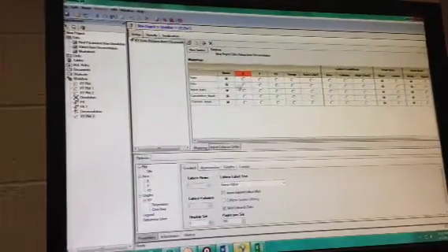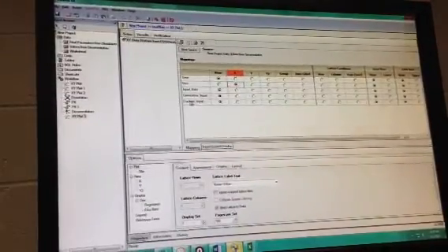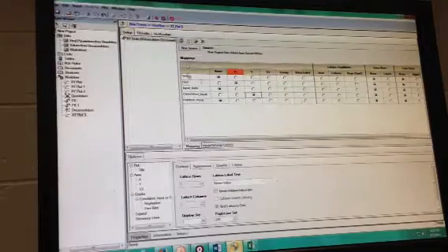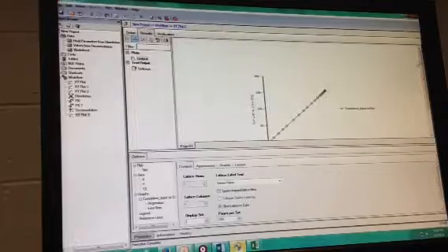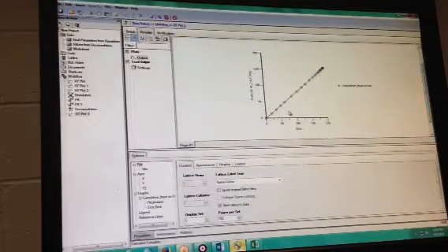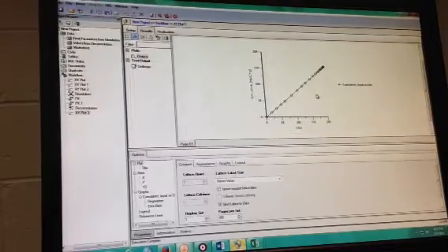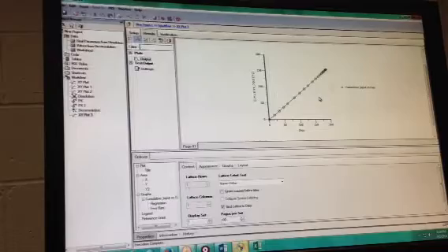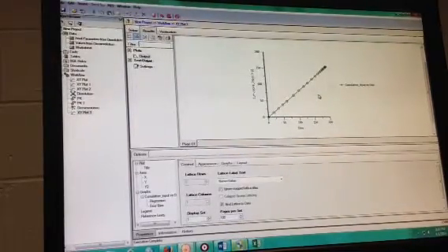I want to plot the dissolution as my x, and the cumulative input will be my y, all right? And let's see, and it's a perfect straight line, all right? This is something you will never see in the real world because these are all simulated data, but eventually this would be a level A IVIVC.